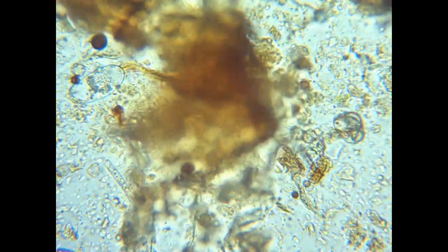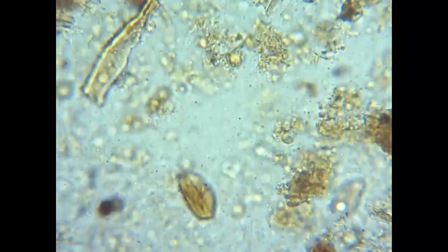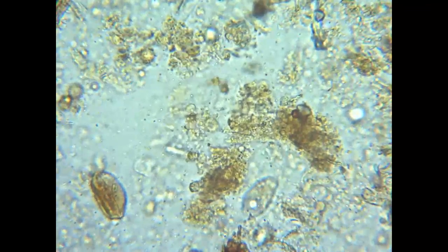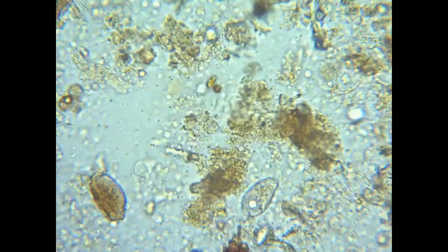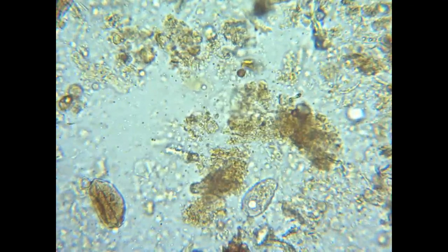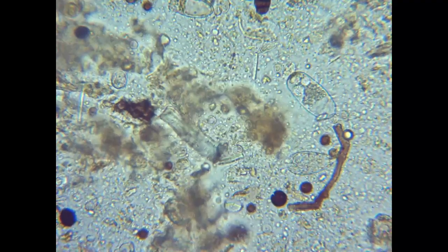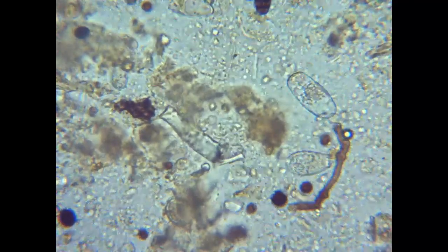You can get actual numbers using a microscope, such as how many micrograms per gram of fungi, how many micrograms per gram of bacteria, and then use that to get the ratio of fungi to bacteria. That's well beyond the scope of this video and will take some training. If you're interested in doing that, I would recommend going to Dr. Ingham's website, SoilFoodWeb.com, where you can take some of her classes to learn how to get those numbers.